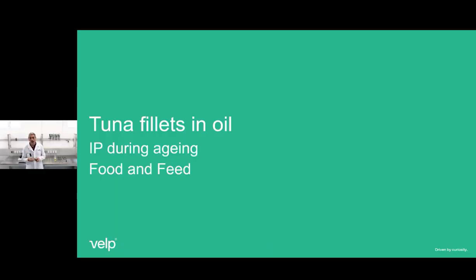Until now, we saw how oxidation stability can be a reliable indicator, very helpful for formulation of products and estimation of the shelf life of the product. But how can the induction period vary over time? During the last application of today, we will better understand something more about the so-called induction period to make more consideration about the method.